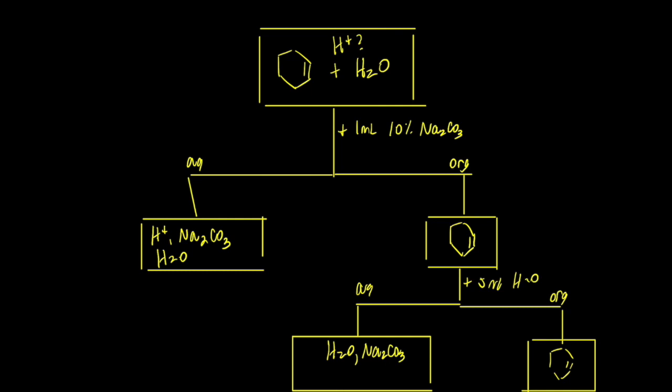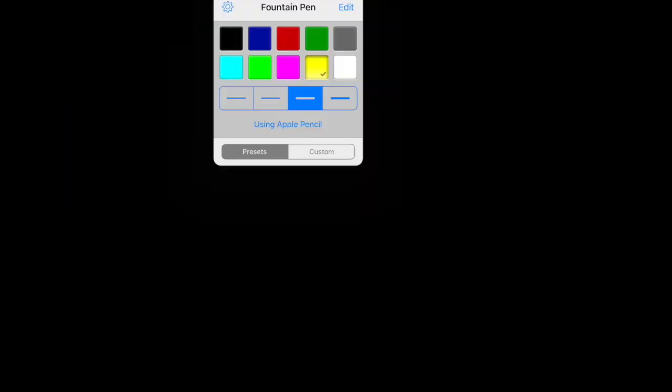We take this and we put it into a flask. Okay, so we have our flask here with our cyclohexene. And you might see a drop or two of water, maybe just a drop, okay? And what we do is we dry the organic solvent. We're going to add about a half teaspoon of anhydrous calcium chloride.